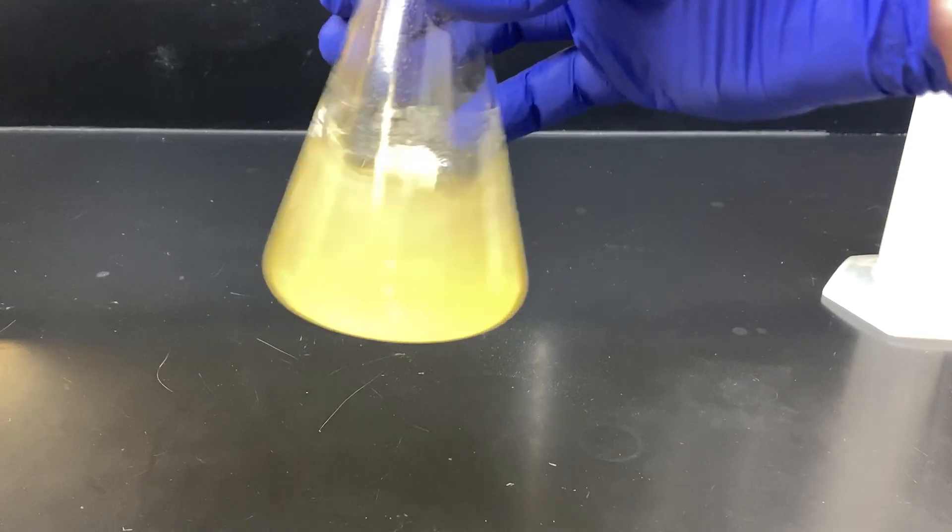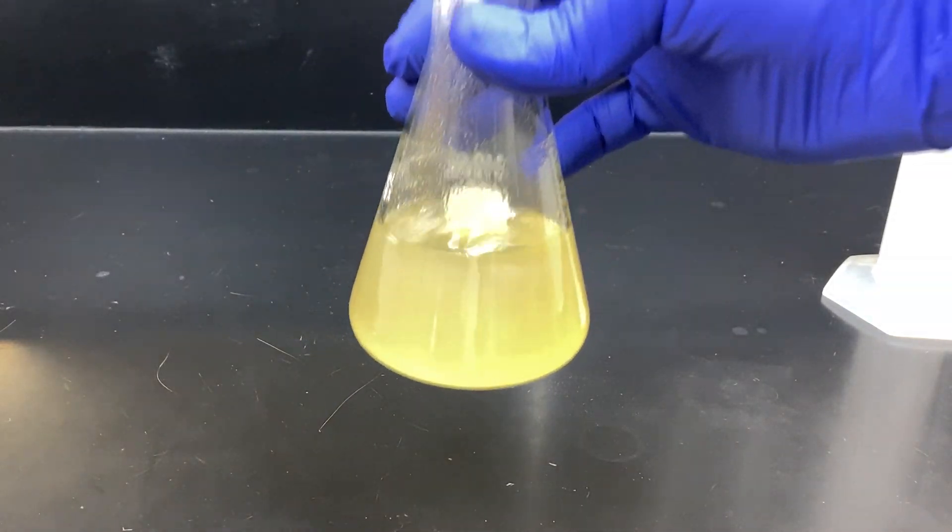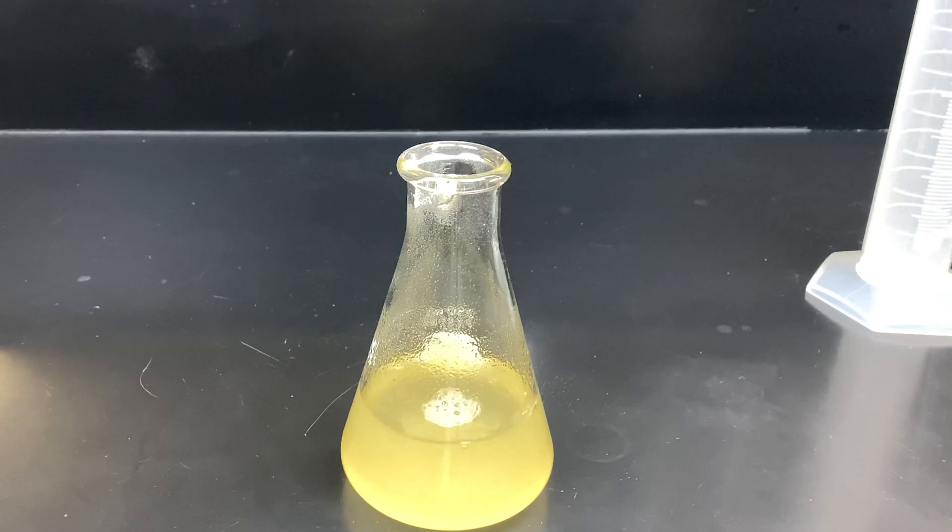We will take care of that during the autoclaving process. Autoclaving is the process where we heat the sample to very high temperatures under high pressure to sterilize it. This temperature will also dissolve the nutrient agar into the water.